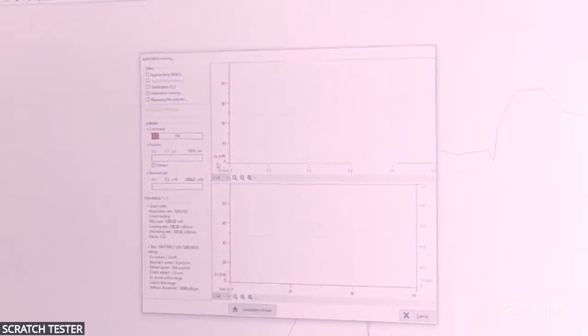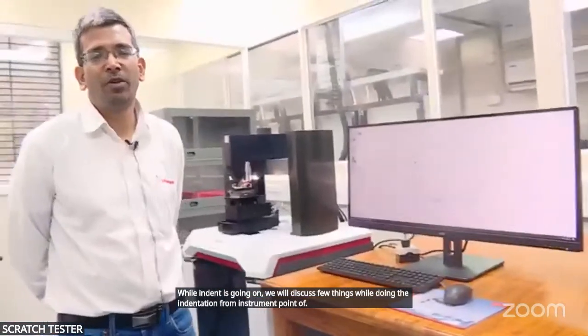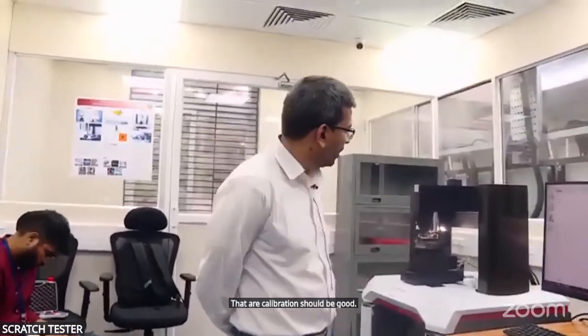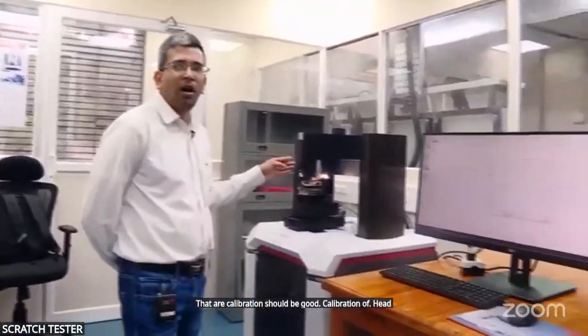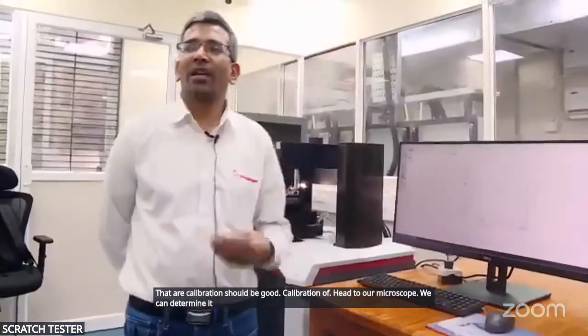While the indent is going on, we will discuss a few things from the instrument point of view while doing the indentation. The important thing, especially for scratch also, is that our calibration should be good. Calibration of the head to our microscope. We can determine immediately if calibration is off.